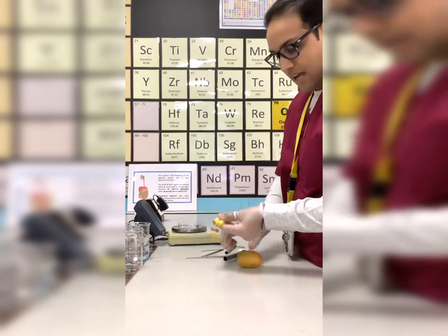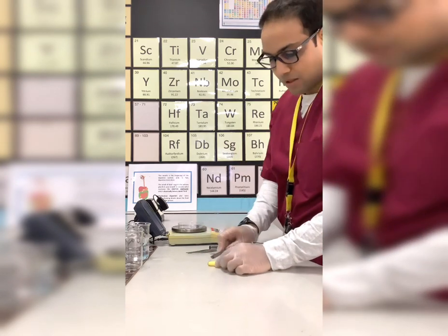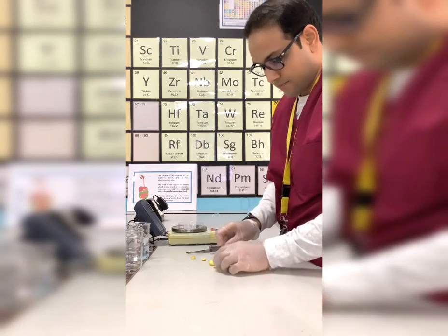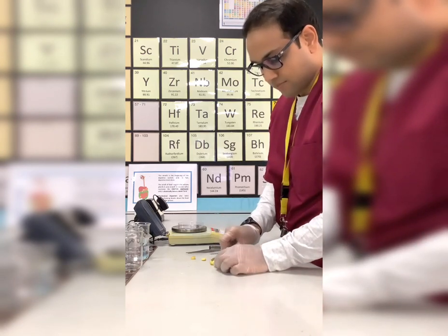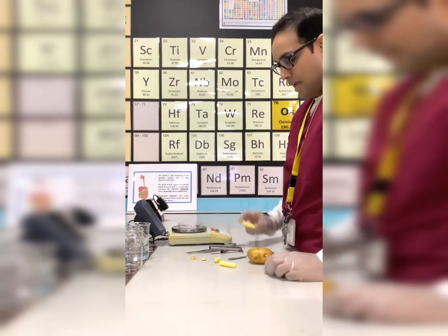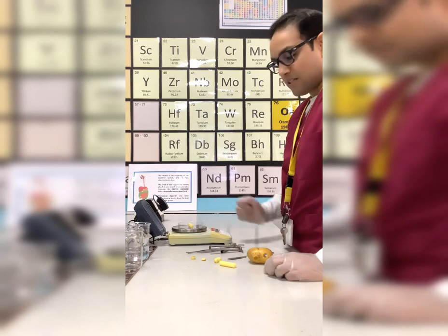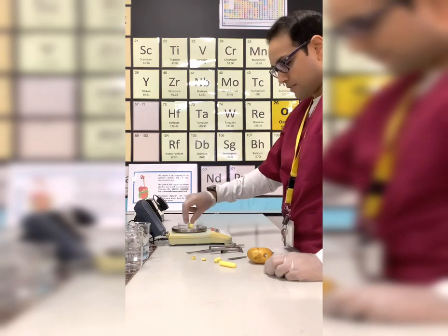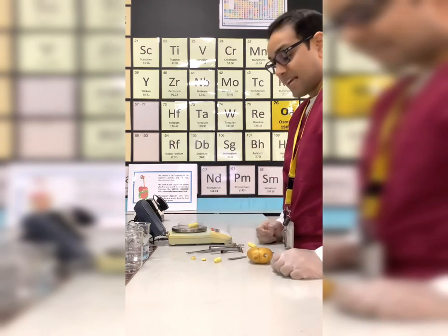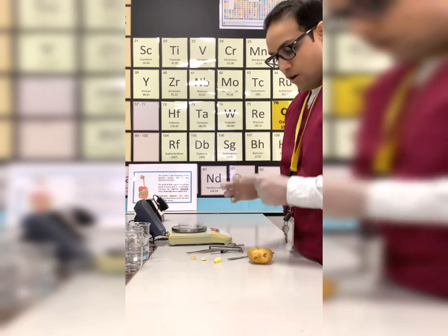Since they are not the same size, we are going to make sure to cut them to the same size and same length. So I'm using the help of my scalpel to cut it as such. Making sure that both the ends meet. Using the help of my petri dish on the balance, I'm going to check the mass. The mass of this potato cylinder is 5.34 grams or 5.35. To confirm again, let's use this. And it's exactly the same, 5.35. So we have 2 potato cylinders now of the same length, of the same mass.